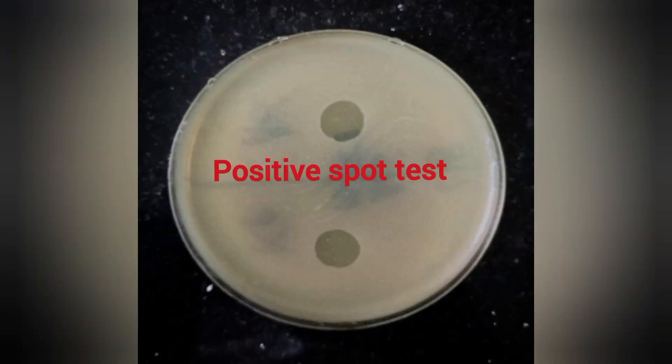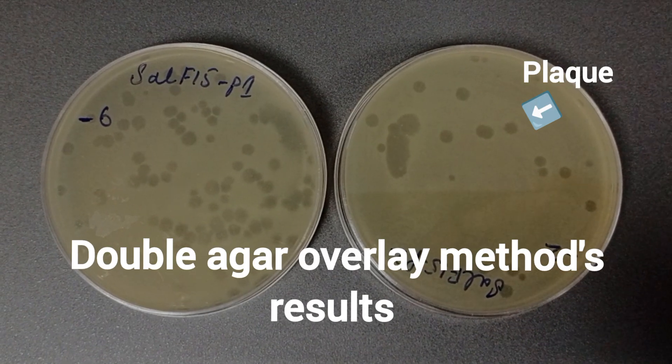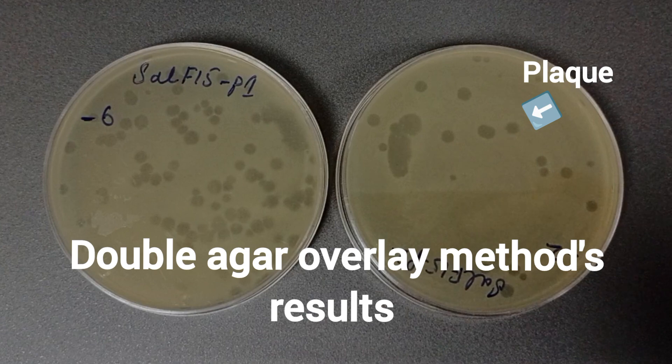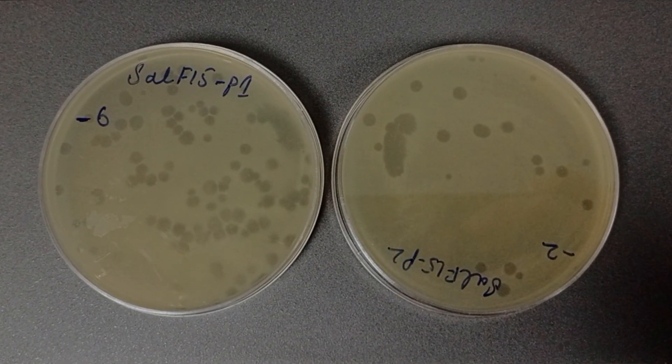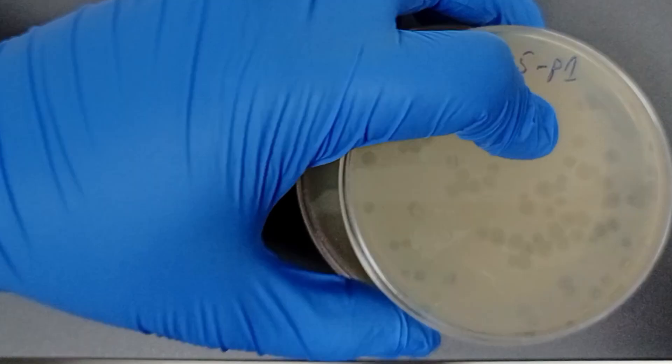We got the positive spot test, which means that there is the presence of phage against the host bacterium. Next, we used the double agar overlay method to test the plaque formation ability for the phages. Today, we are going to purify the plaques for the determination of phage titer.